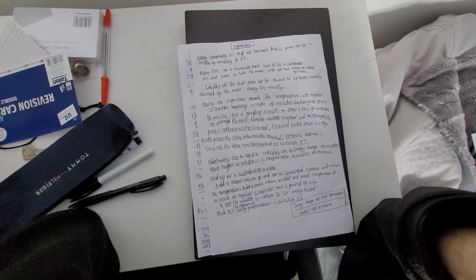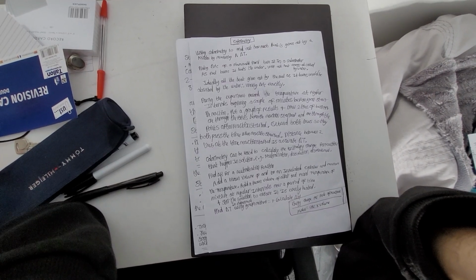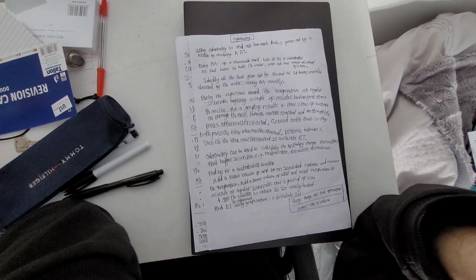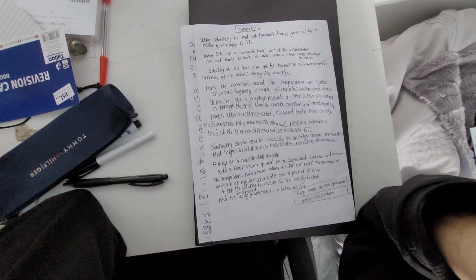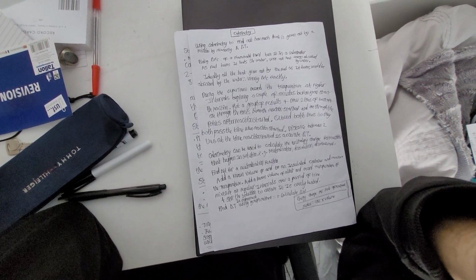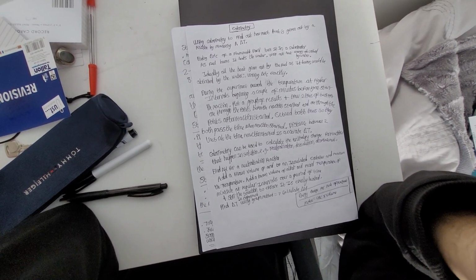Calorimetry, I would like to say, is one of the underrated practicals. So, using calorimetry to find out how much heat is given out by a reaction by measuring temperature change.